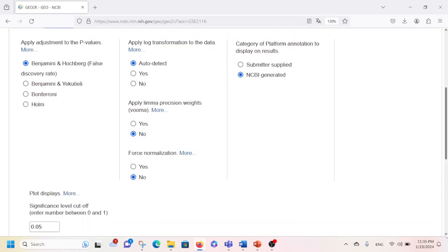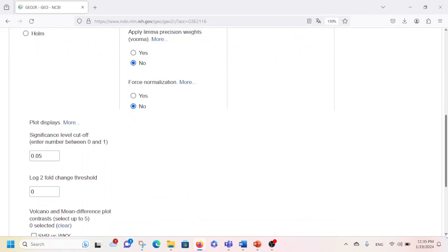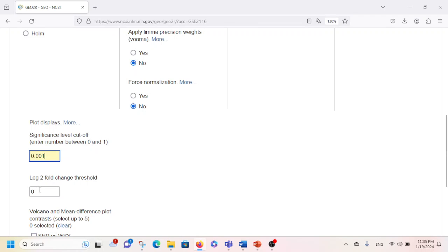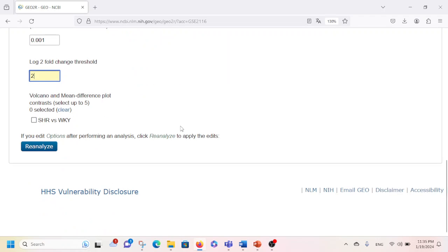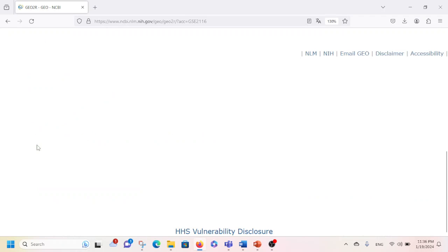You can also click on Options if you want to make some changes. For example, I'm going to change the p-value from 0.05 to 0.001 — so only genes with a p-value of 0.001 or less will be included. I'm also going to change the log2 fold threshold from zero to two. Then I'll click on Reanalyze.